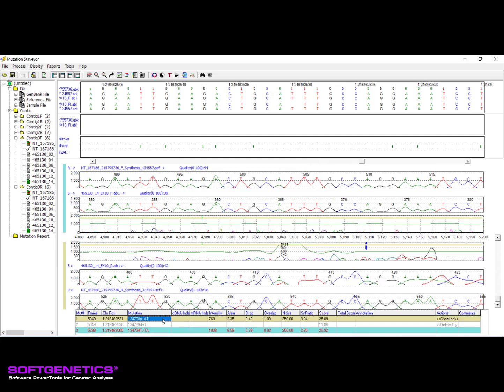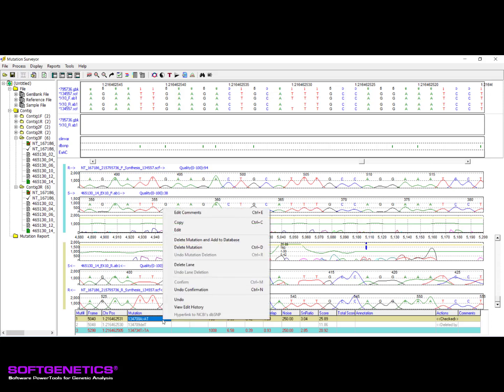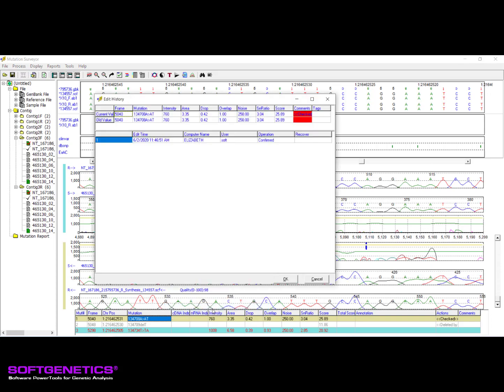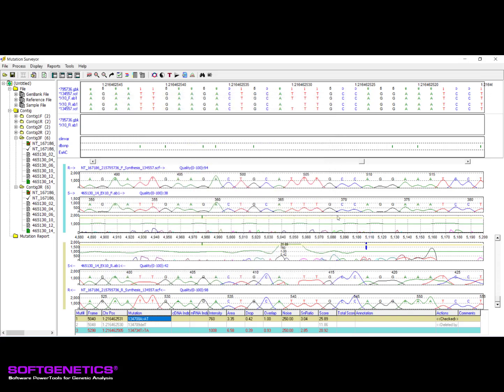The addition and editing of any heterozygous indel call should always be performed within the heterozygous indel detection tool. All calls made to a mutation can be viewed in the edit history, which will become enabled in the call's context menu after an edit is made. The edit history records the timestamp for when the edit occurred, computer location, user, and type of edit.